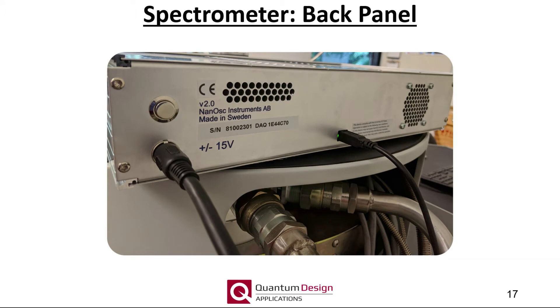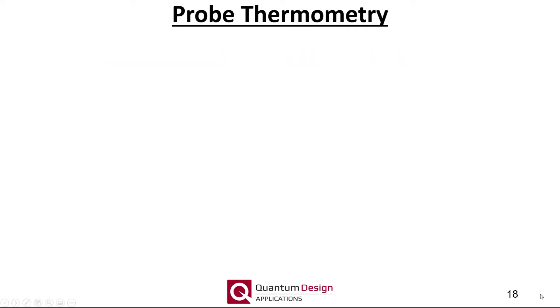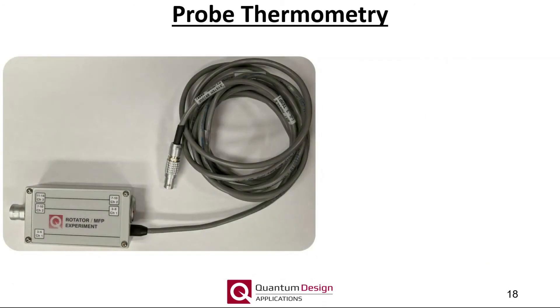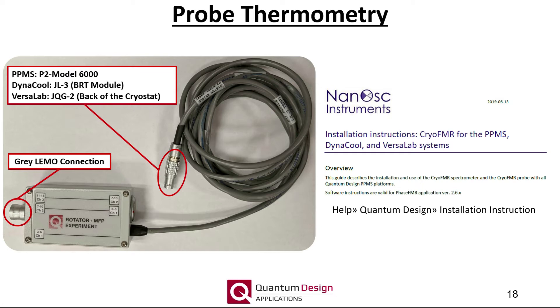As far as the back panel connections are concerned, ensure the power and USB connections are made. It is strongly recommended to connect the Nanosk instrument to the same computer that is running MultiView. Finally, ensure the unit is switched on. Probe thermometry is handled by the standard 12-pin sample chamber wiring connections at the bottom of the PPMS sample chamber and the rotator MFP pass-through cable. This end connects to the standard gray lemo connection on the PPMS, and this end to one of the ports listed here, which depends on the specific flavor of PPMS being used. The system is shipped with a configuration file that converts the CERNOX sensor resistance into a temperature. Detailed instructions can be found in the document accessible from the Help menu in the Nanosk FMR software program.